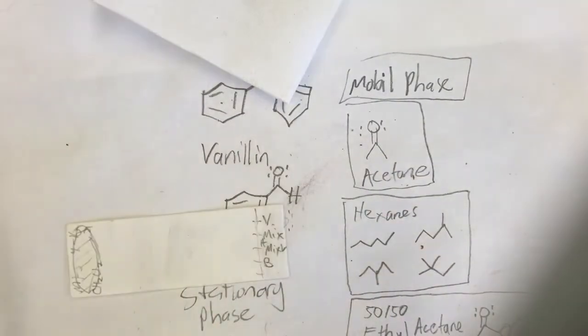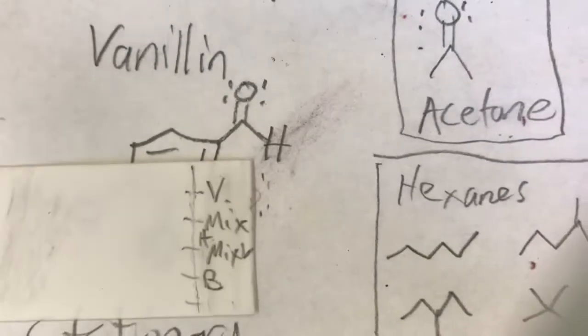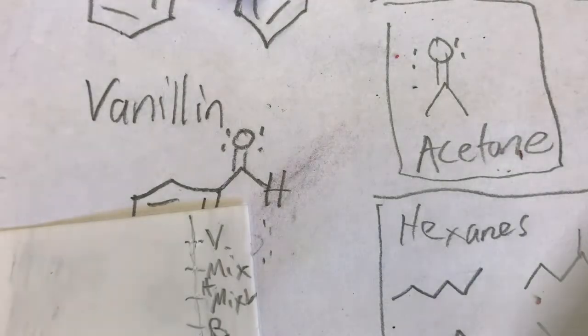Okay, and then I'll come over to my TLC plate and I'll label it. I'll spot it. Let's see if it works. I'll get a little closer for you guys so you can see it better. Okay, here we go. Oops, I broke my capillary tube. It might still work with the end. Let's see, 1, 2, 3. Yeah, it worked. Did you see it? Put this in my little waste beaker.